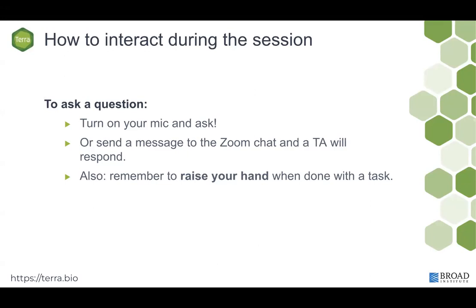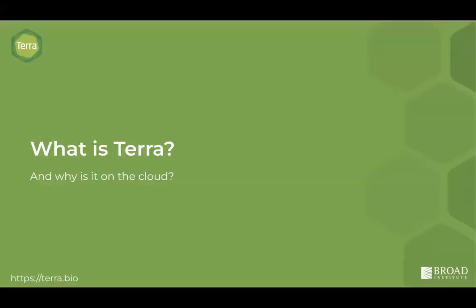Also, remember to raise your hand whenever you are done with a task. Like if I say everyone should go ahead and clone their workspace, or everyone should go ahead and launch their notebook, then it would be very helpful to see that most people have completed this task. All right. So without further ado, let's get started. What is Terra?